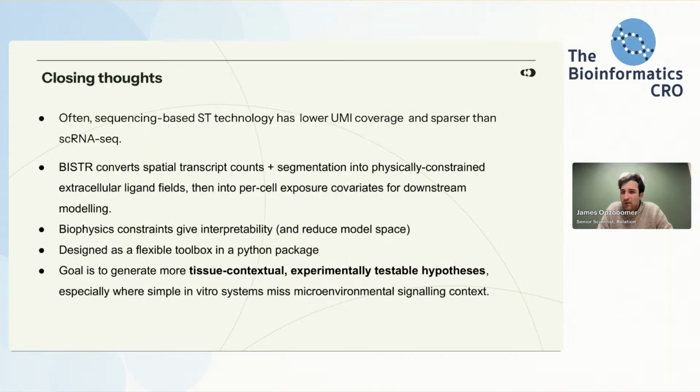So in closing remarks, I think we often find that sequencing-based spatial transcriptomics technologies have a lower UMI coverage that's somewhat sparser than single-cell RNA-seq. This has motivated us to develop novel tools to understand the relationship between intercellular ligand receptor signaling and downstream gene expression.